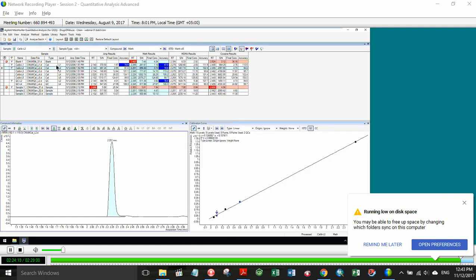And I guess as you noted in your question, the other way to go get them, you can open a method from a batch as well, because that information is within the batch file or folder system. But those are two options for saving the method out to an external file or folder that makes it a little more easily transported.